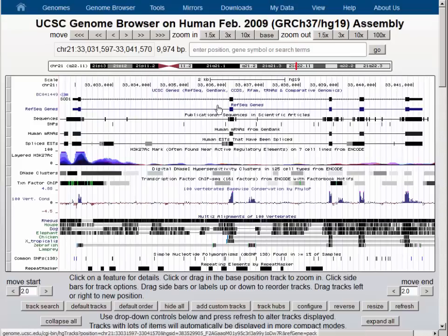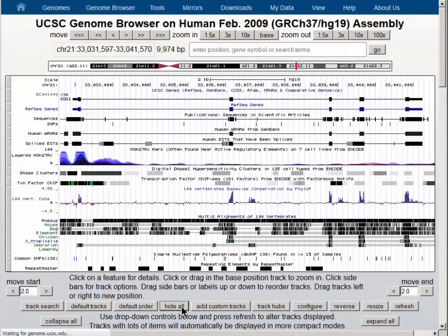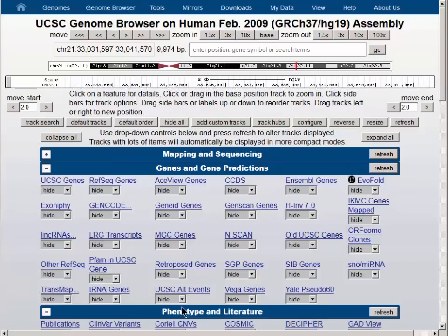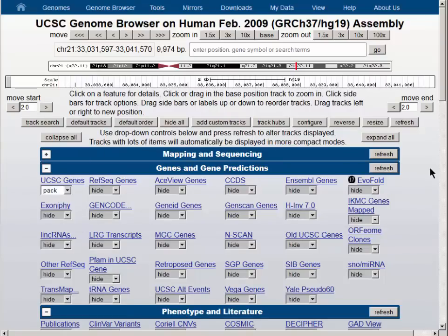The default data are shown here, a number of data tracks. We will simplify the view by hiding all the data tracks, and then we will turn the UCSC genes track on to pack and hit the refresh button.